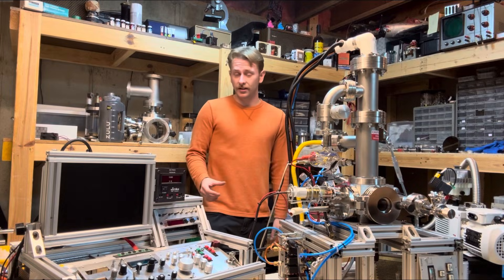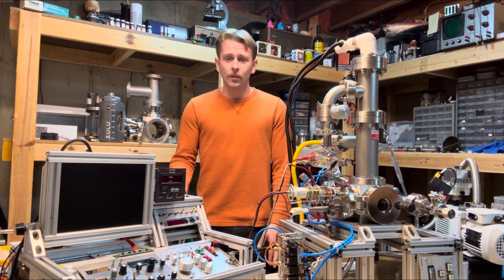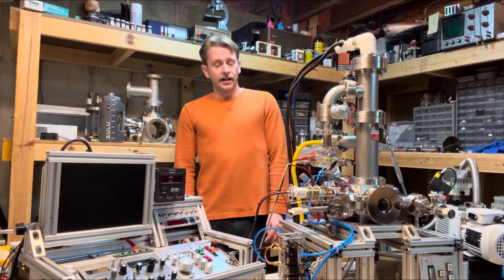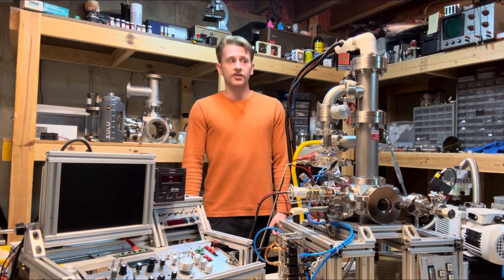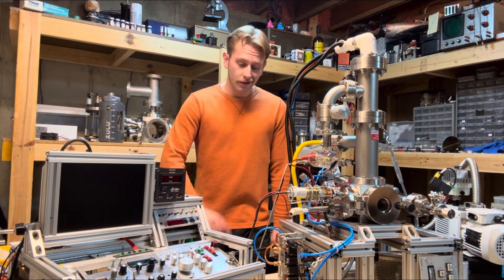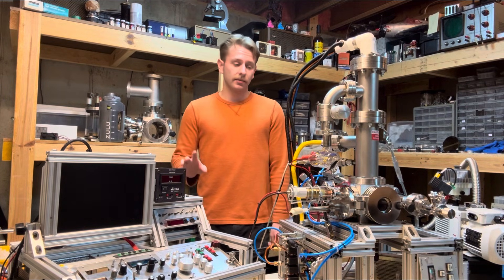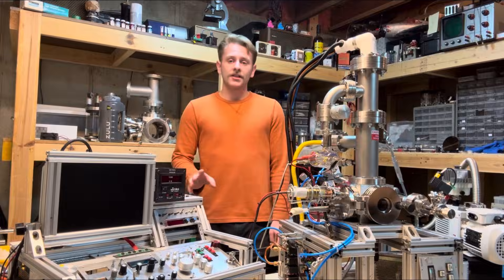Like really putting it together and over the past four months this thing has really come together. It's not done yet, it's got probably three, four months left until it's actually running. The electronics, they're going to be a beast to tackle. I've got most of them done, most of it planned, but here's where we're at so far.